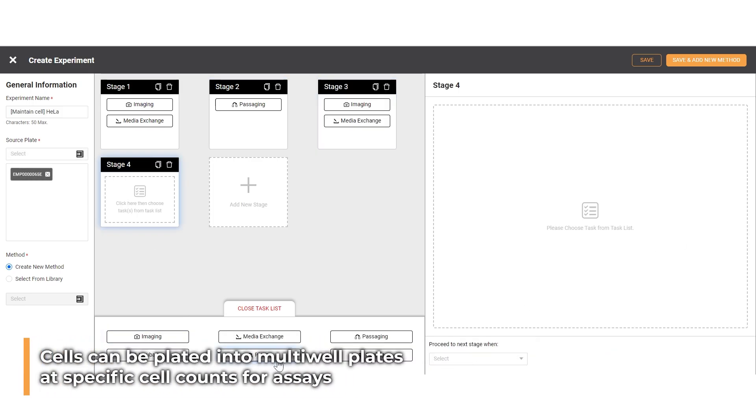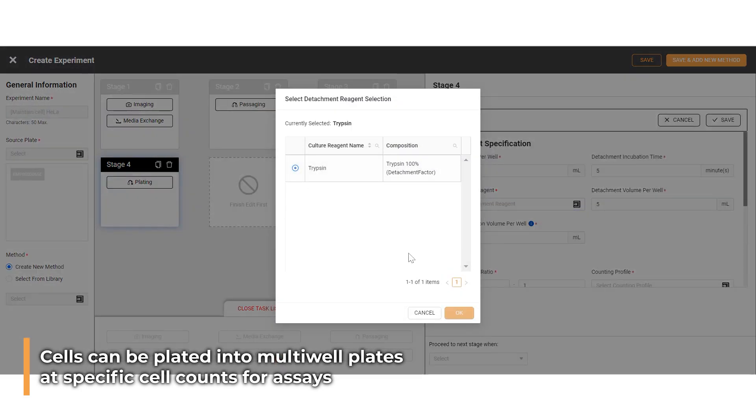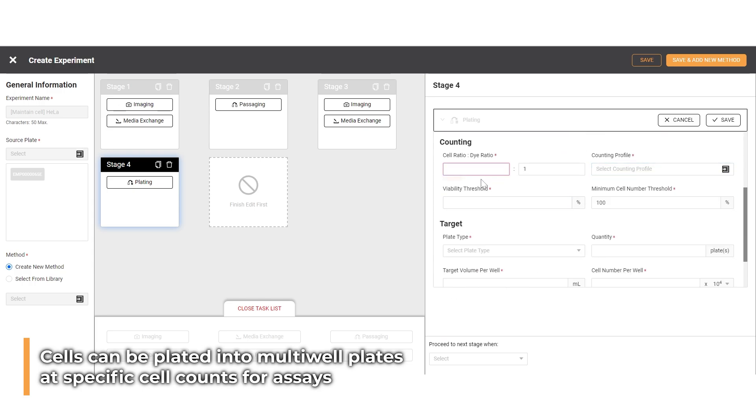Apart from cell maintenance, using the plating task in Cellmatic can help users to prepare the cells into multi-well plates for conducting external assays with the specific experiment.